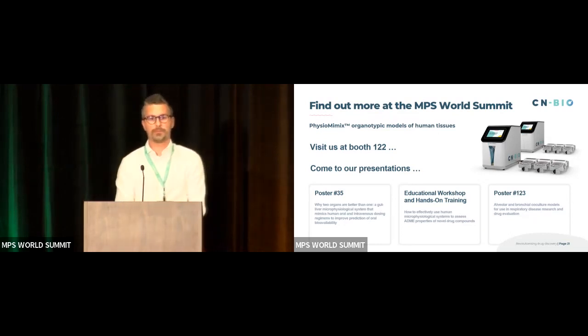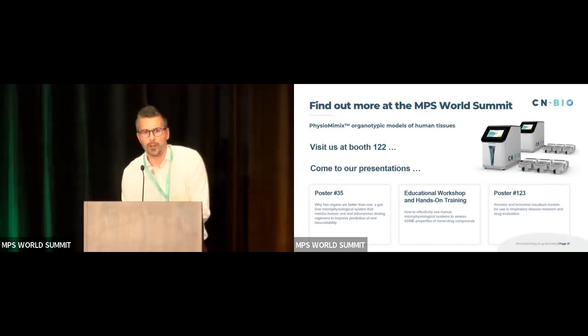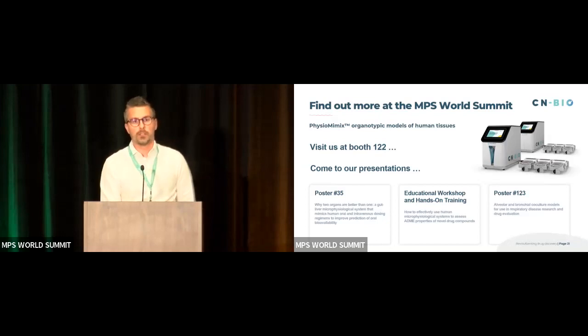I'm Donna Mendrick from NCTR FDA. So I have a question. At the beginning, you mentioned you can use primary hepatocytes, cell lines, iPSC. Have you done that kind of comparison where you looked at metabolic activity over time and other aspects to see which incoming cell type is most important? Sorry, I think I only caught half that. Okay, was your question, have we done HEPs, iPS, and cell lines in parallel, and looked at metabolic activity over time and the other analysis you did with primary hepatocytes? I'm just wondering how the other cell types acted.